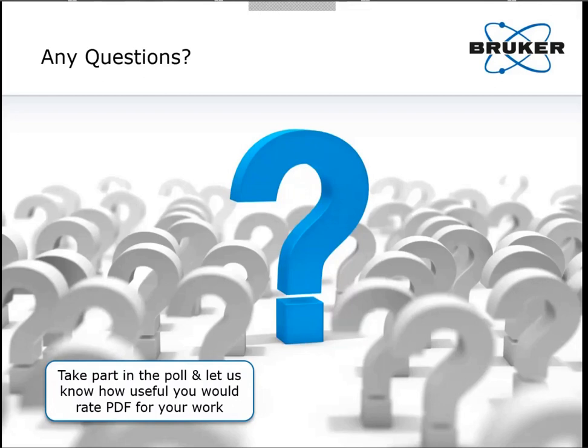there's a question on, can I use PDF also for organic materials? How big should the sample be? What kind of information can I get from organic material with PDF? So certainly, yes, you can measure organic materials with the PDF. So for example, if you have something that's amorphous, you can see the local structure of an amorphous organic material, which would be essentially the molecular structure.